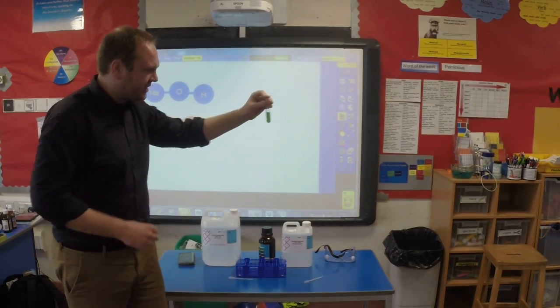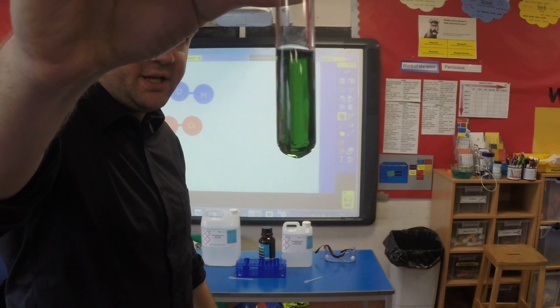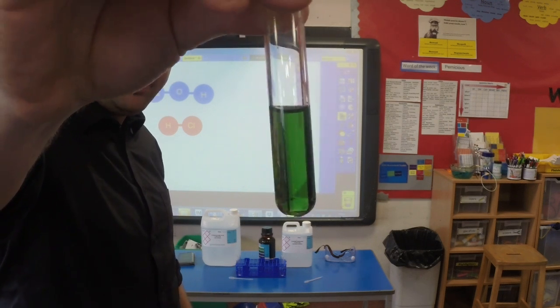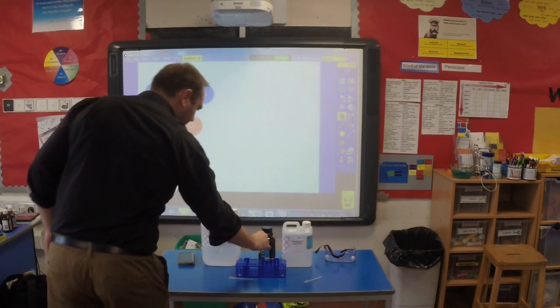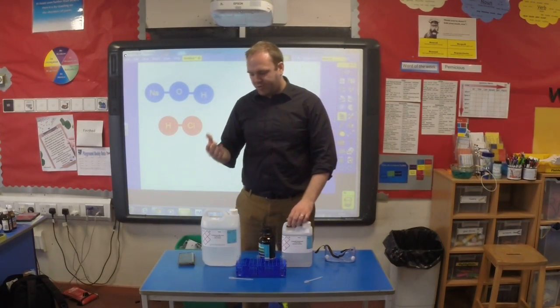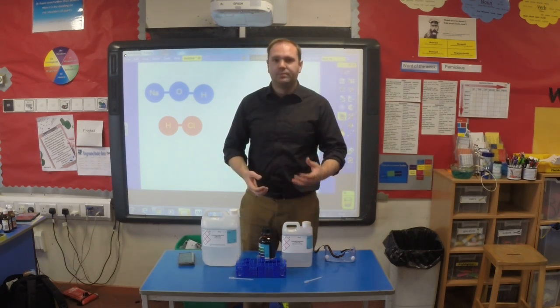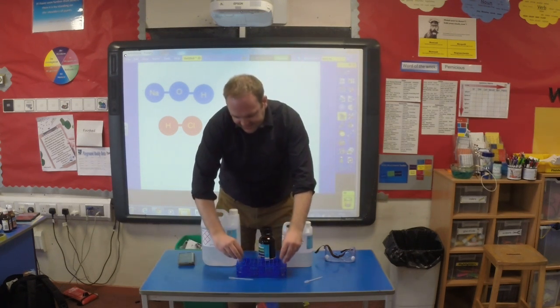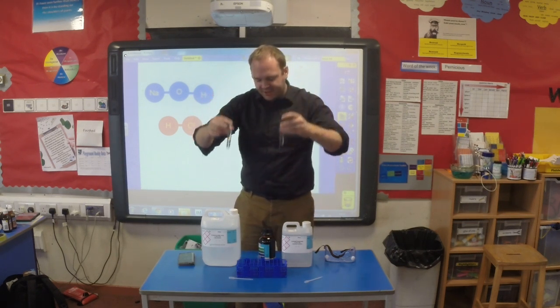We put our universal indicator into the water, and we can explain to them that where universal indicator is concerned, green means neutral. So we have a nice green solution here. We then explain to them that if universal indicator goes red, it's more acidic, and if it goes blue, it's more alkali. Now you don't necessarily have to tell them which one of these is the acid and which one is the alkali. You can let them discover that.